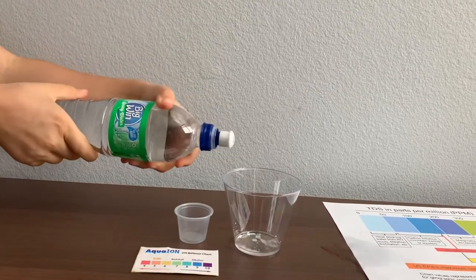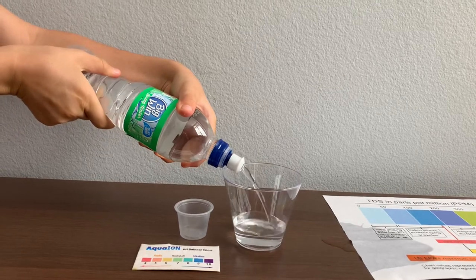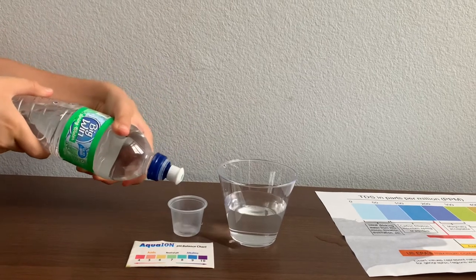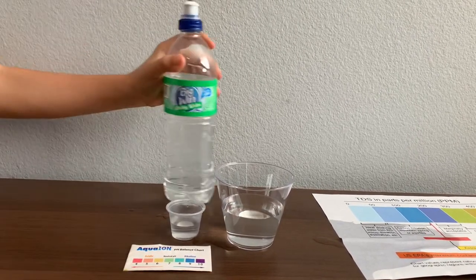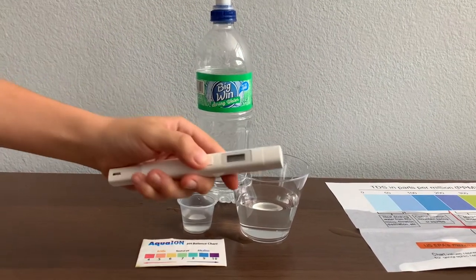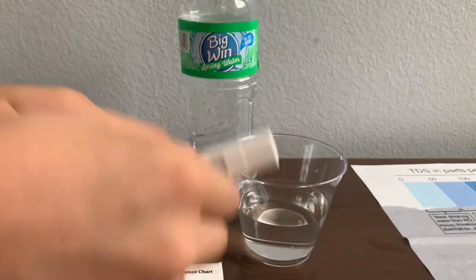Let's pour some water in. First, let's test the TDS. Turn on the TDS tester, make sure it reads 0, and put it in.